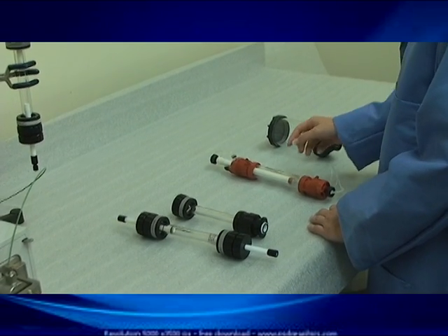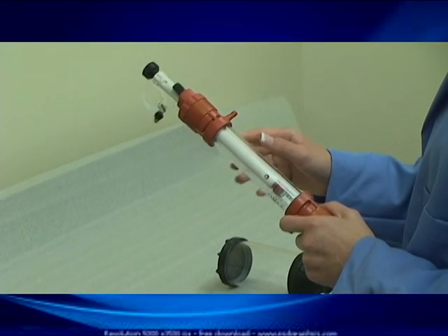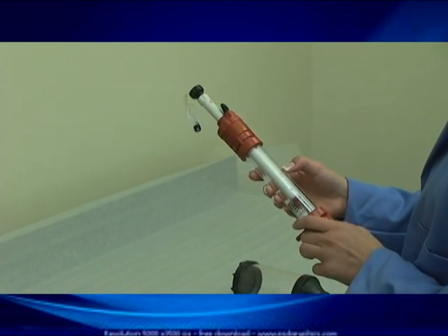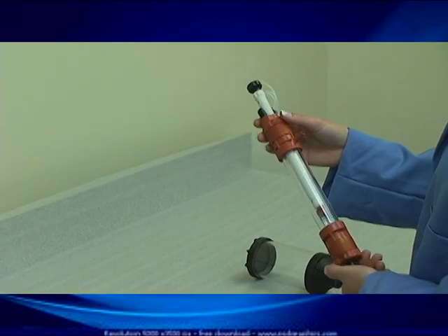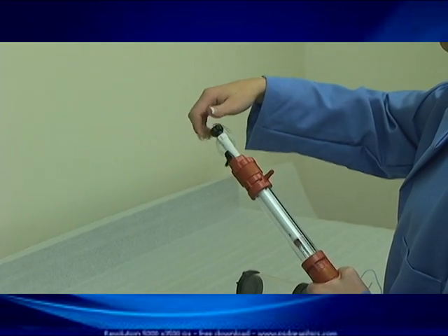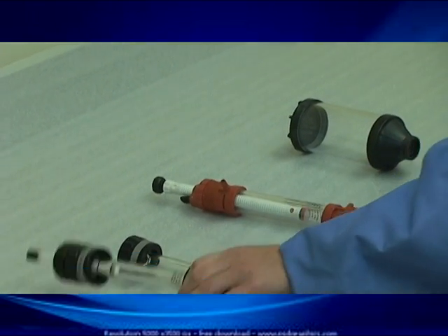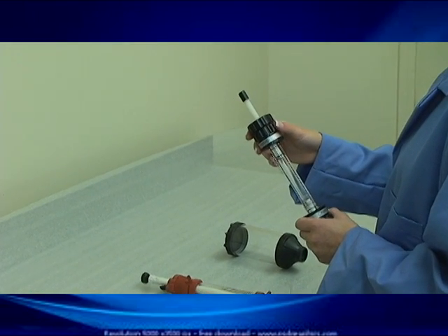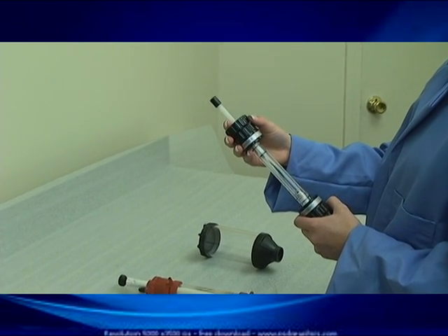The second feature is that all Essential Life lab columns have true redrawn glass. On the comparative column, the glass is wavy on the inside diameter and is not precise, which creates a number of issues. First, there is a wall effect produced as liquid runs through the column because the glass is not the same diameter along its entire length. Second, there is a need for an external o-ring adjuster to compensate for this lack of precision, and the o-ring can be over- or under-tightened depending on the end user — it is a very subjective process. With ELS columns, we use a true precision bore glass, manufactured by redrawing over a mandrel to within a tolerance of three one-thousandths of an inch over the length of the column. This is true rifle bore quality glass.